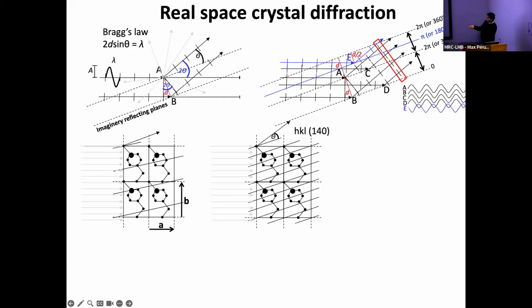If the family of planes is going to divide the A edge only once, you're going to get 1. If the B edge is going to be divided 4 times, you're going to get 4. If you consider now that the C edge is coming out of the screen, our planes are parallel to the C, they will never meet the C edge, you're going to get a 0.